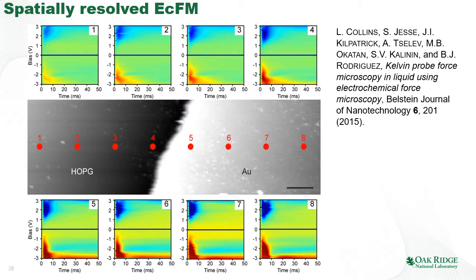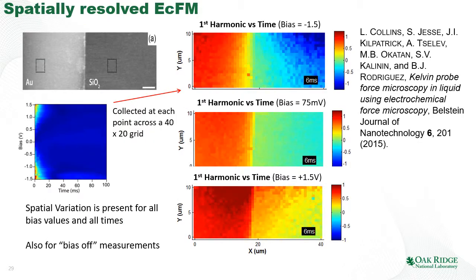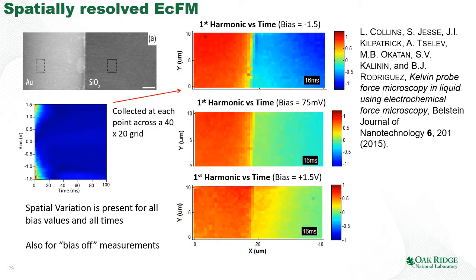So the question becomes, how can we visualize these measurements? This is high-dimensional data, because in scanning probe microscopy we want to do the measurements over a two-dimensional grid, and in this case our measurement signal is also two-dimensional. One way to do it is to look at the cross-sections. For example, we can collect this two-dimensional object at each point of the sample surface over a dense grid.